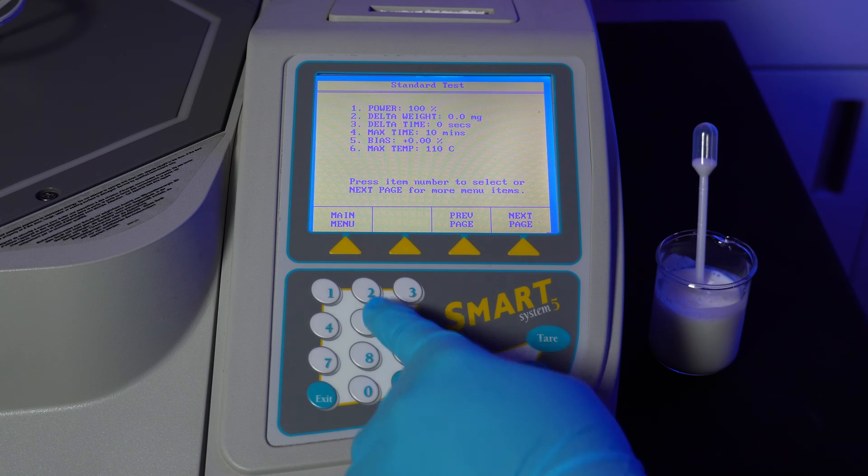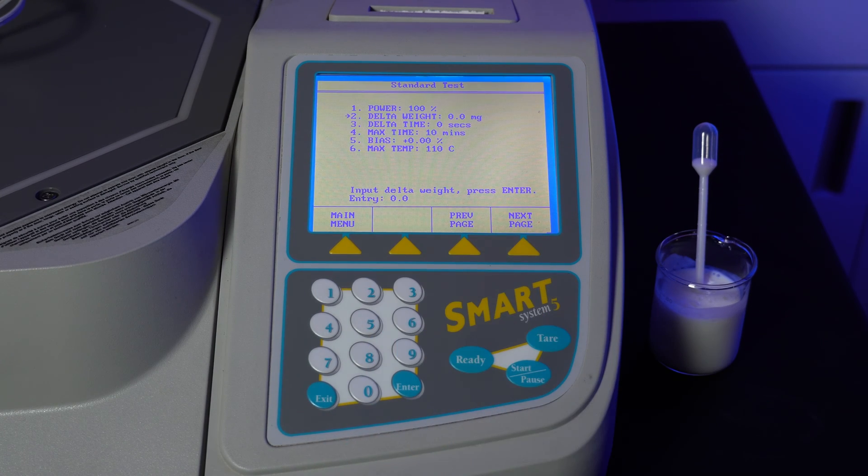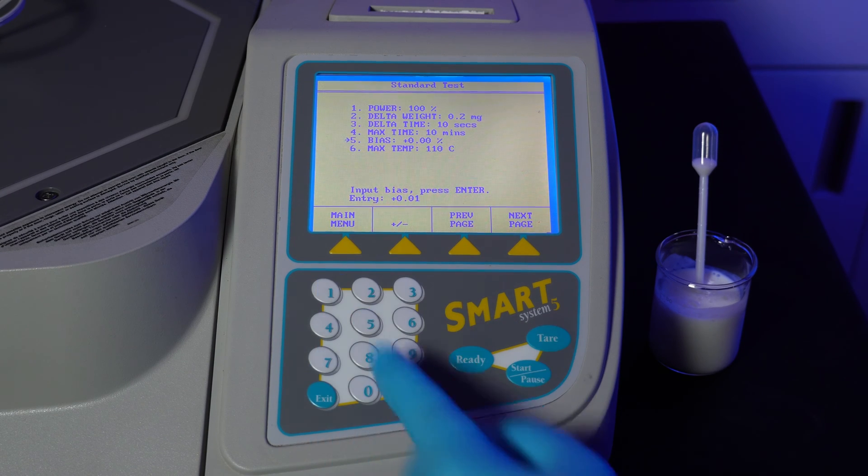For delta weight, we want 0.2 milligram, so hit 2 to select this option, then 2 again, then enter. For delta time, we want 10 seconds. Max time we'll leave at 10 minutes.